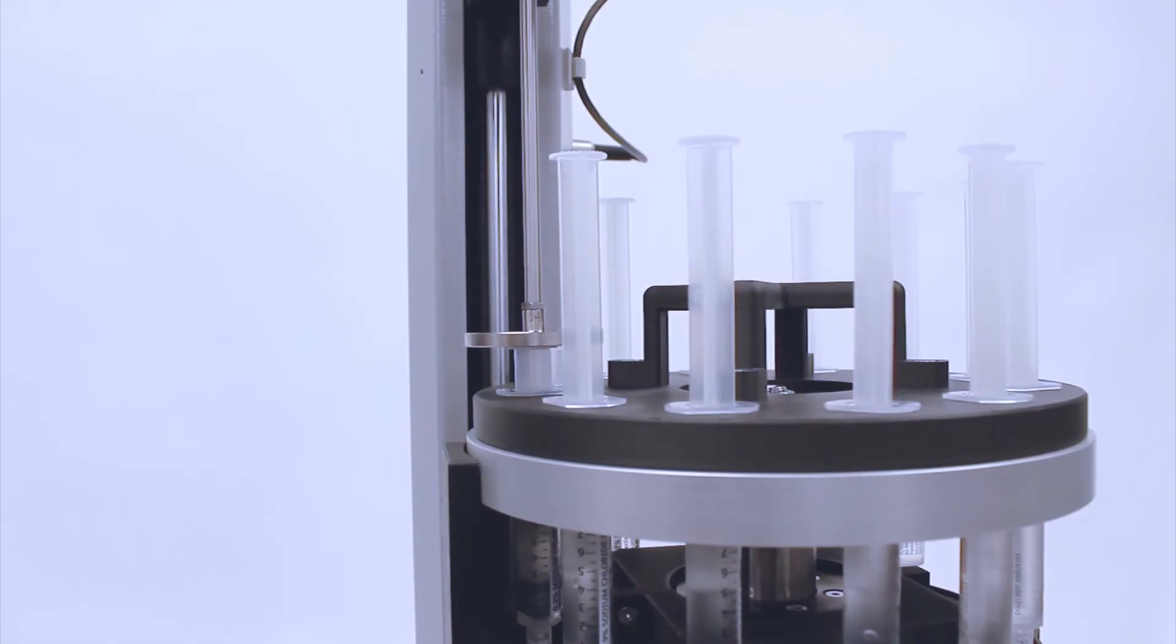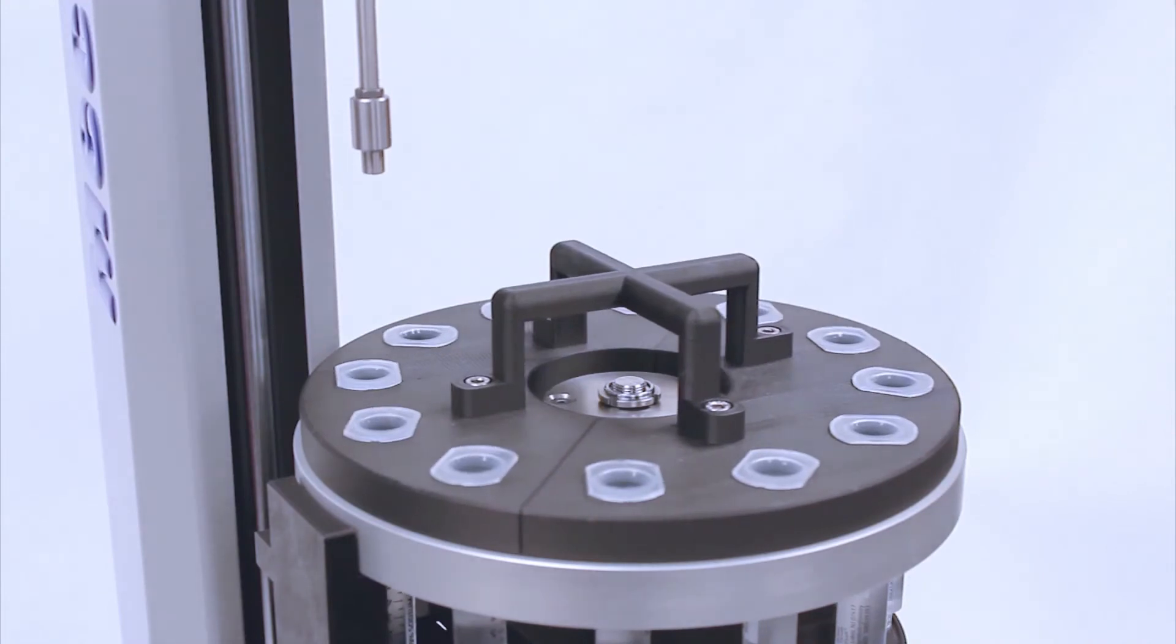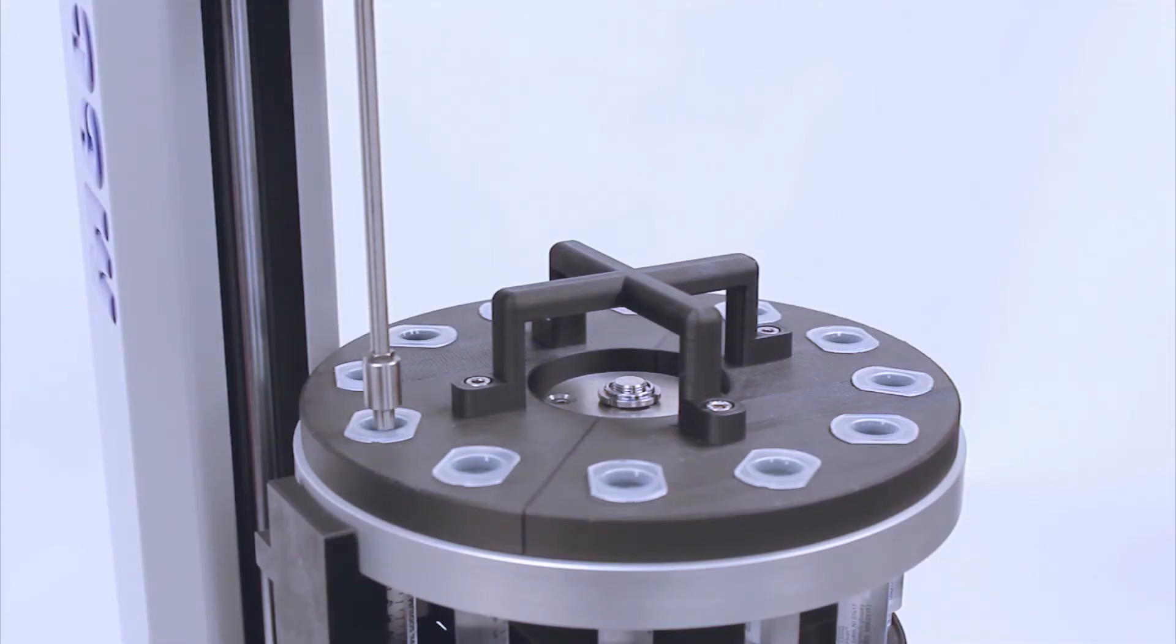Each stage of the test sequence is controlled by Mecmesin's Emperor software. It recognizes where the syringe is positioned and then indexes it to the correct spot.